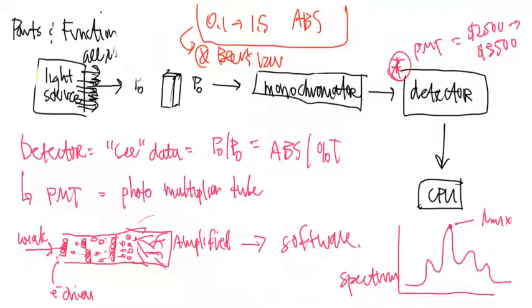Think about it as you looking through the cuvette. If something is too concentrated, it will be too dark. So if I put two things that are too dark next to each other, and one is slightly darker than the other, but to your eyes you still can't see through it, well, the machine can't either. There's no difference there.